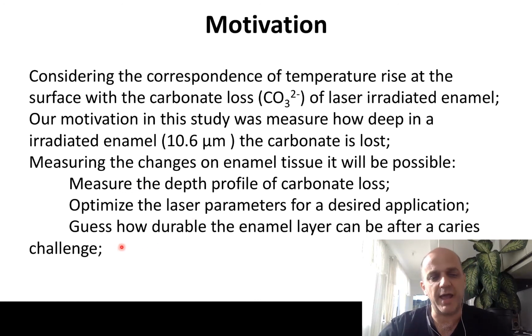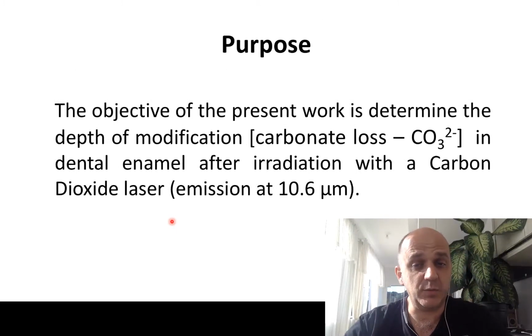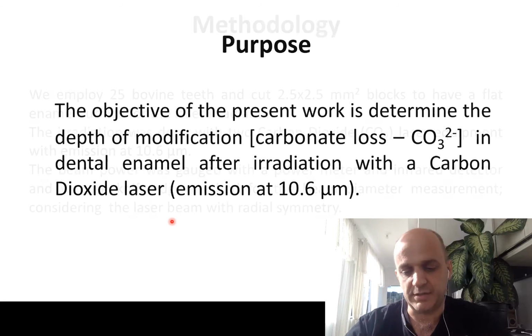Also, you can have a guess of how durable the enamel can be after a caries challenge. In resume, the objective of the present work is to determine the depth of modification, measuring the carbonate loss in irradiated enamel after irradiating with a carbon dioxide laser with emission at 10.6 micrometers.